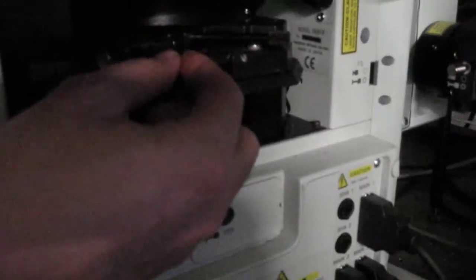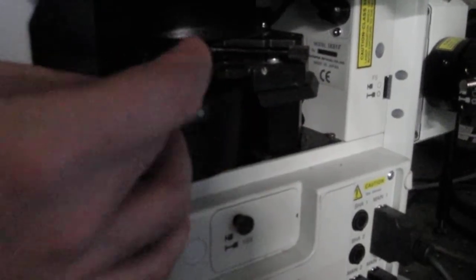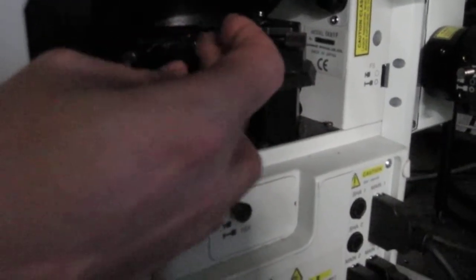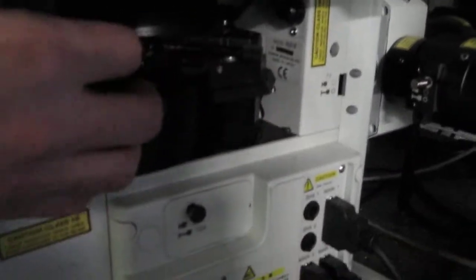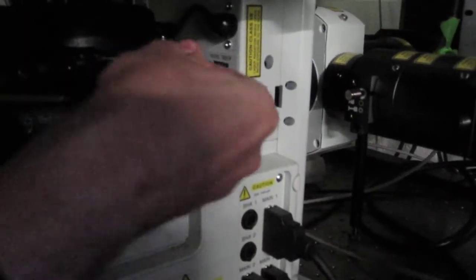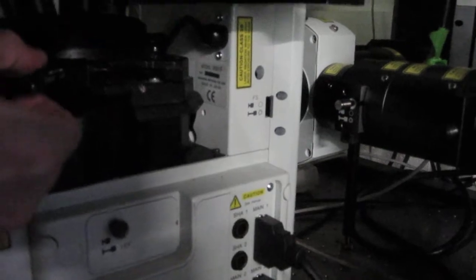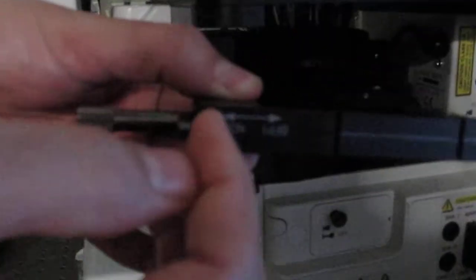Depending on the objective that you're using for DIC, this lever has to be in or out. For the 60x, it has to be in. For most other objectives, it has to be out. But that is actually something that's written down in the objective. If you can see here, in is for the BFP1 setting, out is for the normal setting, and if it's supposed to go with BFP1, it says so on the objective.